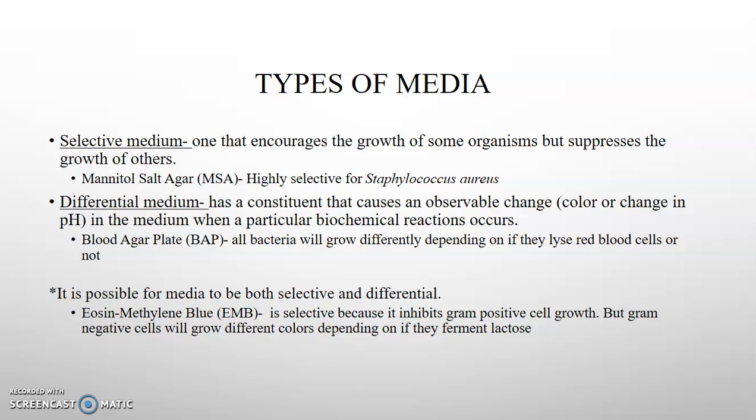So if the plate is both, only certain types of bacteria will grow. However, those certain types of bacteria that do grow will typically grow different colors based on how they interact with the media.